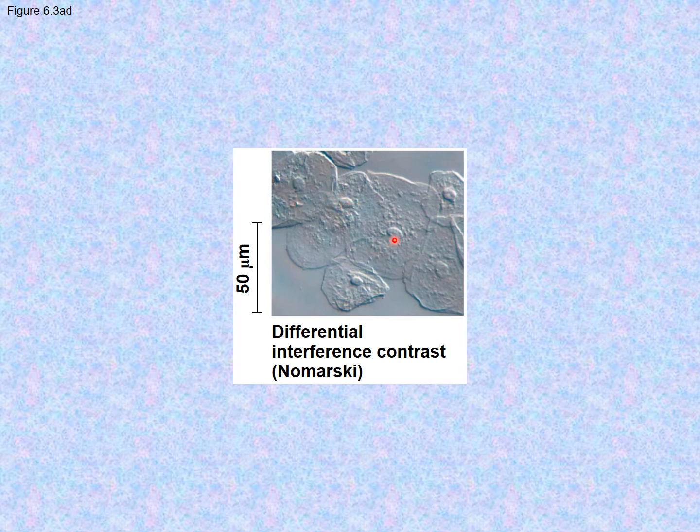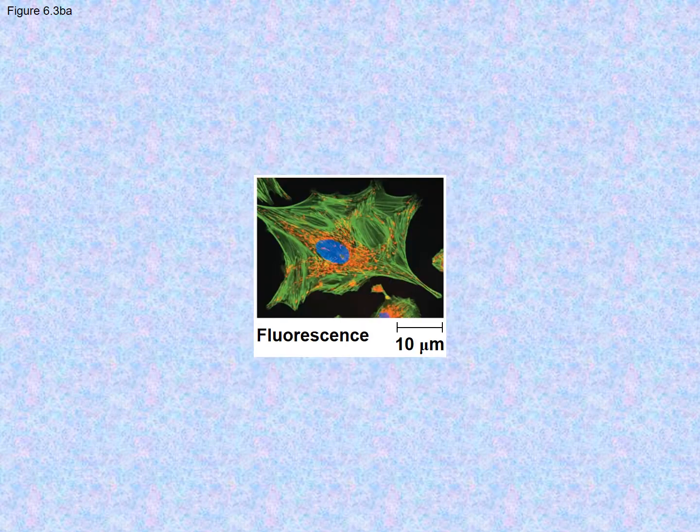It looks like it projects out of the cell, and you can see actually where this cell is underneath this cell, and it's lifting up the top cell right along the edges. So you can see that a lot better, more three-dimensional. Okay, so now we're getting into some more exciting bright colors.